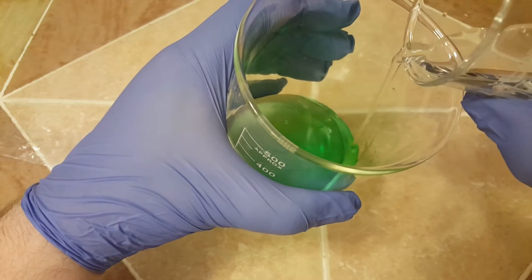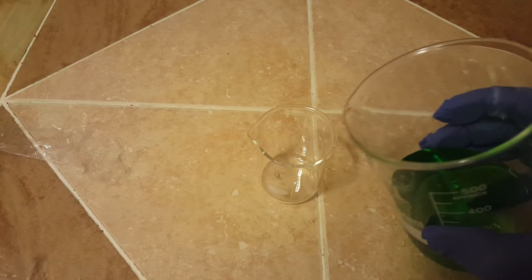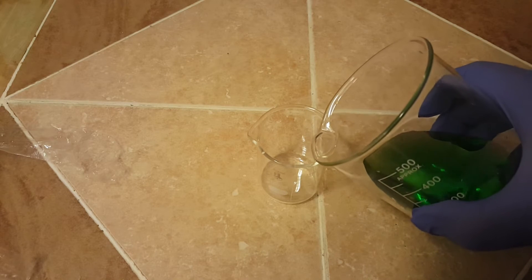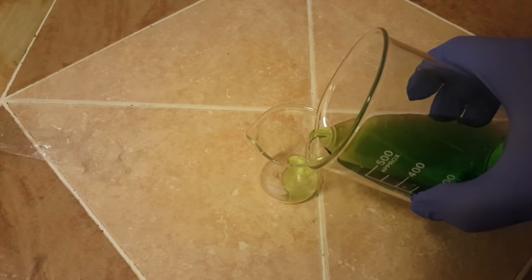You can see that this shifts from a light green to a very dark green. The next step is for visual use only — I'm going to decant a small amount of the solution into a 50 ml beaker.